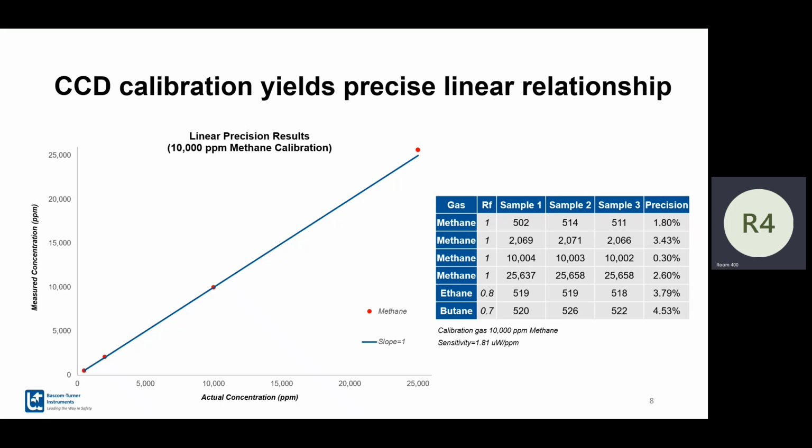And just for the heck of it, I also measured ethane and butane. Yeah, that is ethane and butane. And this is our response factor for those. And you can see their precisions were also very good, even though my calibration was nowhere near the numbers that I'm trying to measure. So that was our scientific thought behind why we chose one.